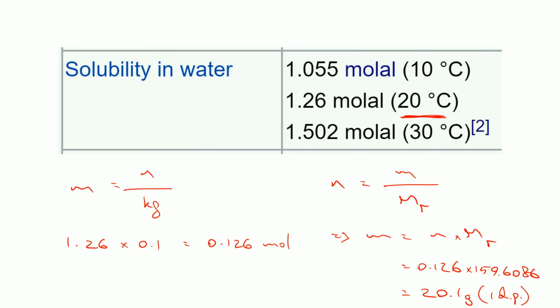No harm, no foul, but I would use more salt. I'm just trying to conserve my salt. We try and conserve chemicals where we can, okay? Because I'm not actually going to measure out 20 grams. That's how much could dissolve at 20 degrees Celsius. I'm actually going to heat this up. I'm going to get it boiling.